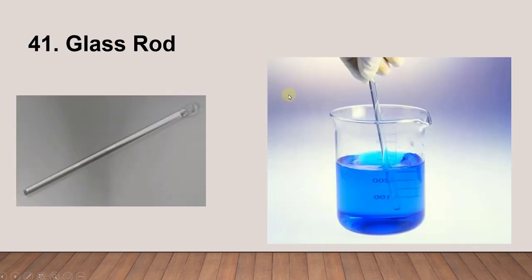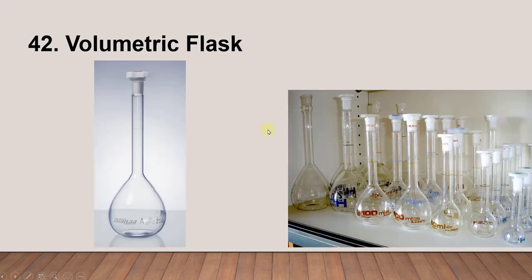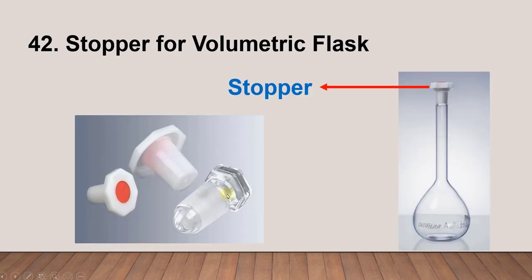Next is various glassware that you can see here. Next is the volumetric flask. This is important when you want to prepare a precise concentration — you need a volumetric flask. And of course, when you work with a volumetric flask you need a stopper.